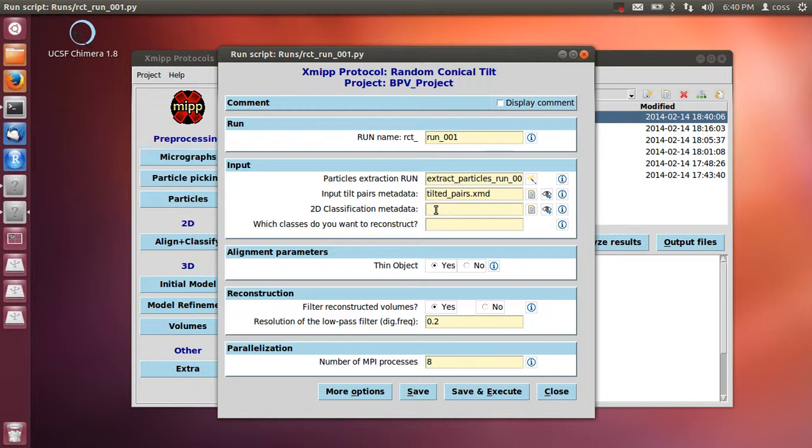So you go here with the classes computed either from CL2D or ML2D, and you may use classes, class cores, stable cores, or the classes at different levels, level 0, level 1, level 2, whatever. Then you would have to say which classes to reconstruct, but this will be done in a separate tutorial.